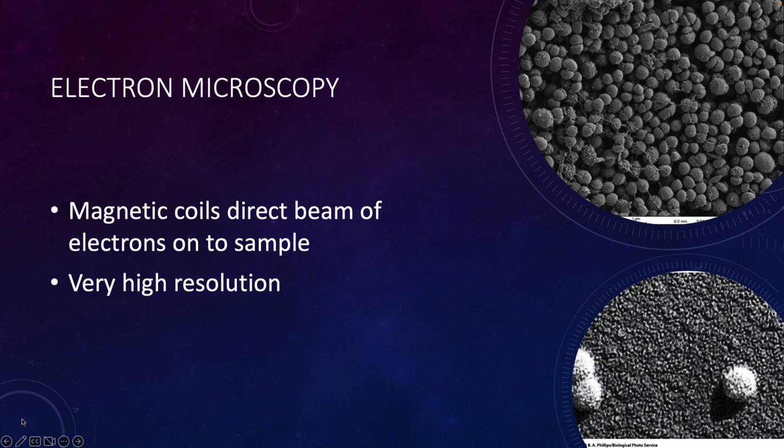So this relies not on visible light, but as it says, electrons. It's a beam of electrons. And because those have such a short wavelength, you get really significant resolution.